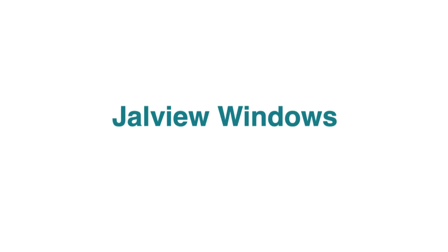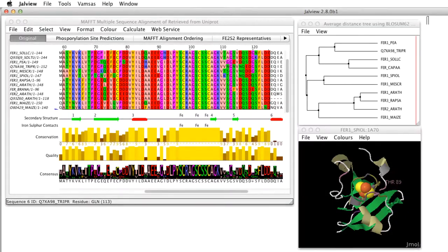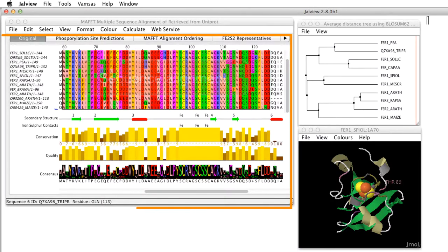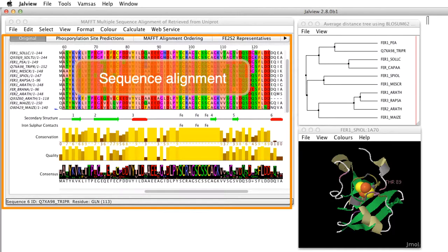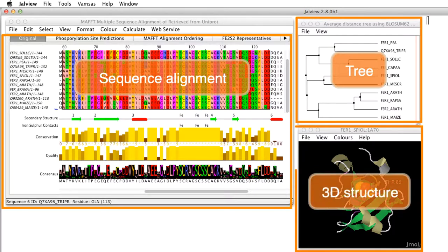There are several different types of viewing window in Jalview. In the configuration that opens when Jalview is launched there is an alignment window, tree window and structure window visible.